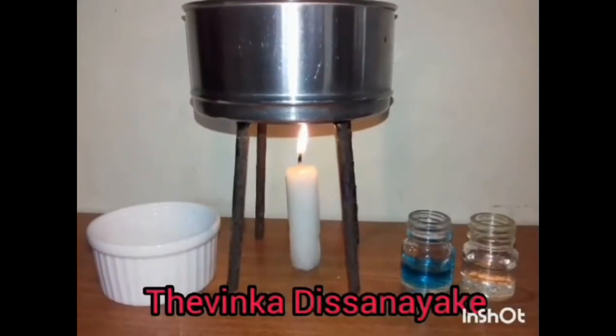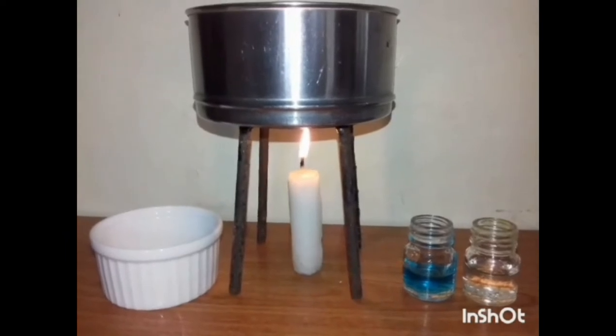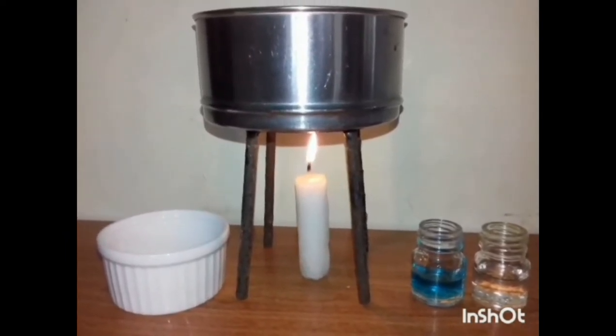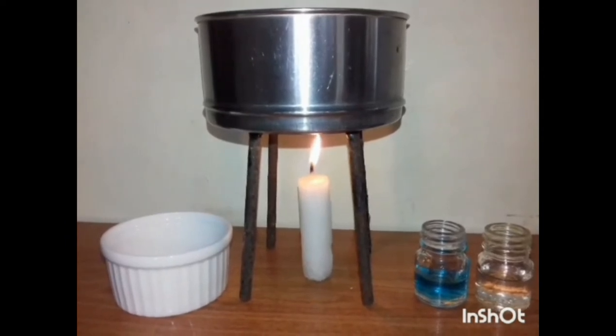Hello my friends, today I am going to do the glucose test. I need a cup, glucose solution, benedict solution, and a water heater.